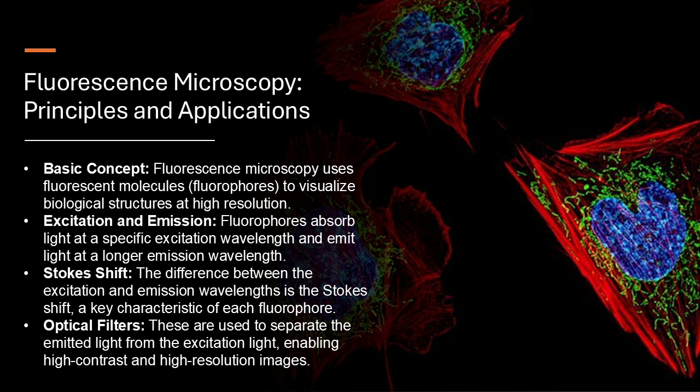Plus, since it uses lower energy light, it reduces the risk of photobleaching, that ticking clock we talked about earlier. So multi-photon microscopy allows for longer observations and deeper penetration into the sample. Right. It's a gentle giant of microscopy. I like that, a gentle giant. That's very apt.